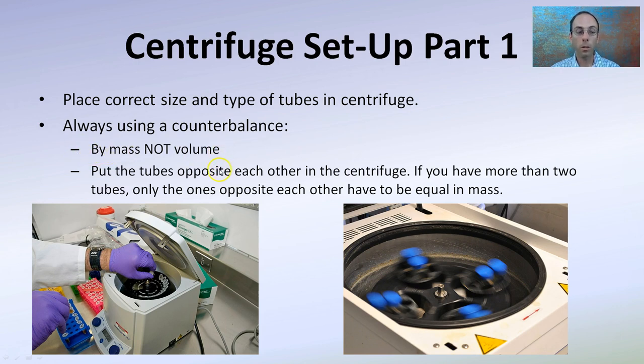So if you put 10 mils of something on one side — if it's water-based, put water on the other side and you'll be in good shape. But make sure it's by mass, not by volume — that's how you keep it balanced. If you're using a substance that's a lot denser than water, you don't necessarily want to just put water on the other side, because the volume might be the same but the mass will not. Place the tubes opposite one another in the centrifuge.